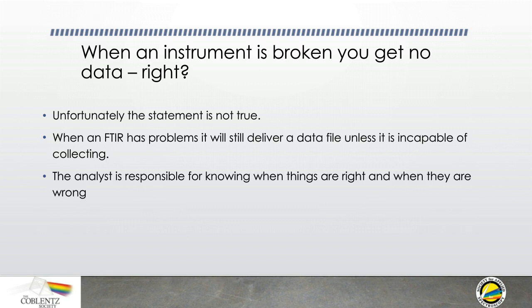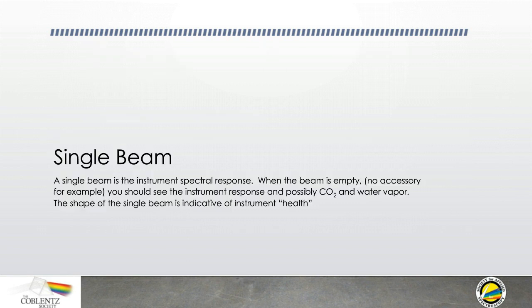As I said, the instrument may actually be broken, may actually be slightly broken. And it's the analyst's job to understand what the spectrum should look like so that you know when things are right and when things are showing up wrong. Now, one of the first things you should look at is what's called a single beam.